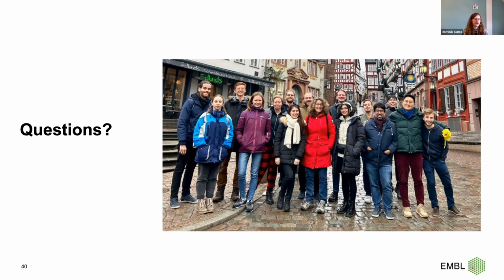So everything you generate currently in Ilastik itself will be what we call shallow machine learning. This is a classifier that is trained with very little training data and is very fast to train. The classifier we use is the random forest, and those models you can produce, save, and load again. The other part is the more involved deep learning models. As you said, you can load them directly from the BioImage IO Model Zoo and try them out on your own data.